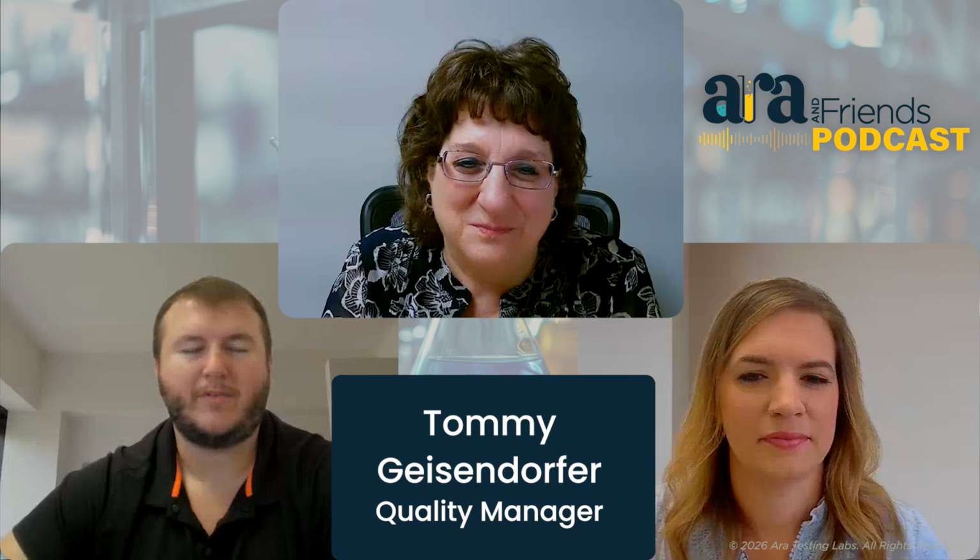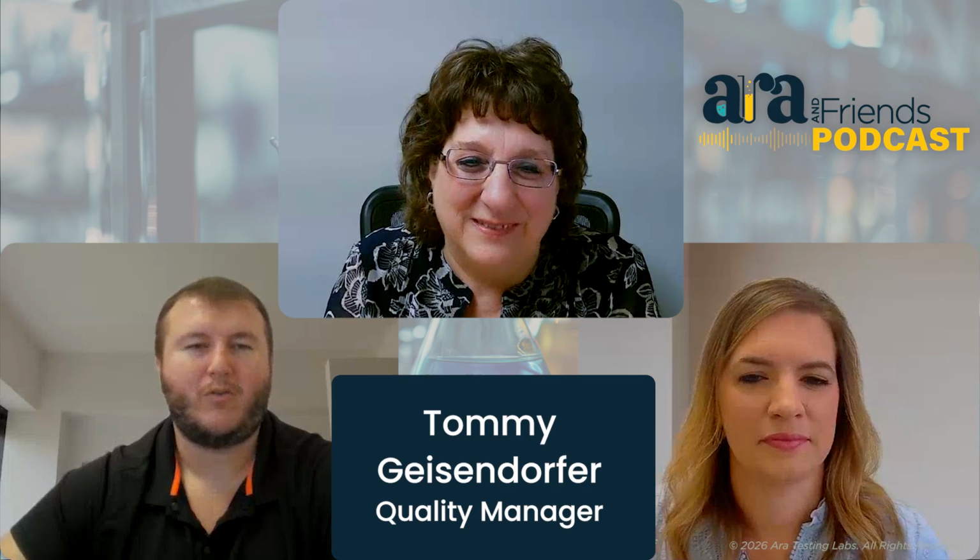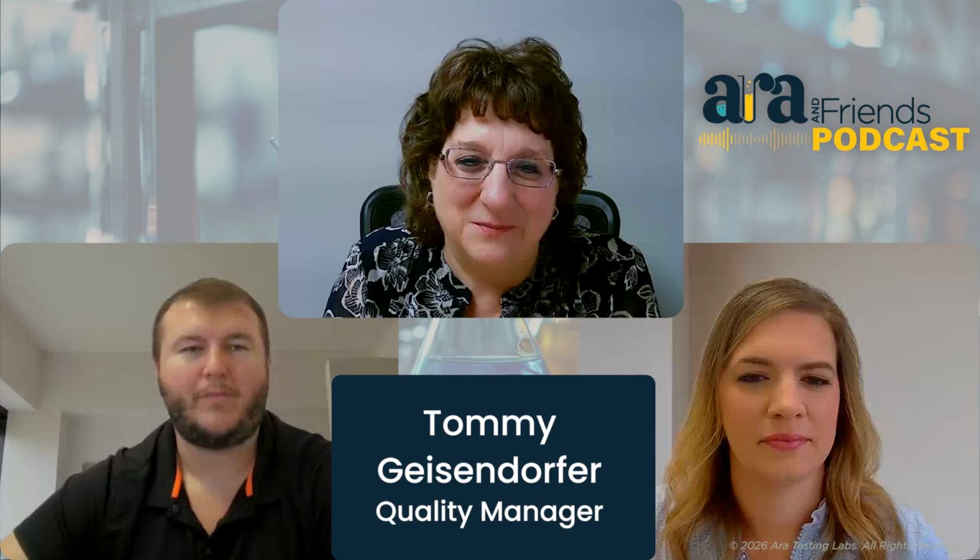All right, I'm Tommy Geisendorfer. I've been in the lab setting about 6 years. I started out as just a typical chemist, microbiologist, analyst. Worked my way up into quality, and now I'm the quality manager here at Ara Testing Labs. And we're going to show you some micro testing procedures today.